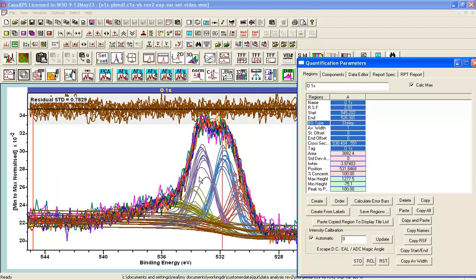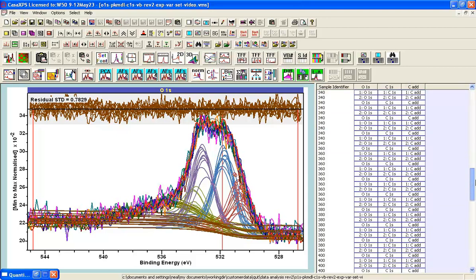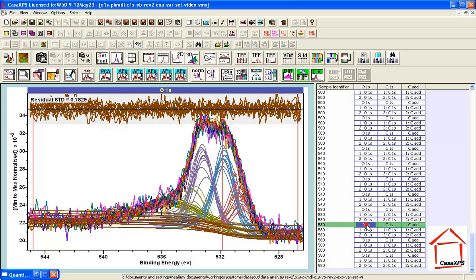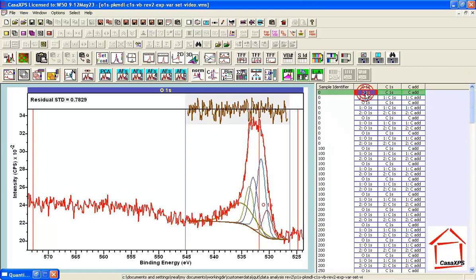While the peaks are relatively stable, this is no guarantee we've found the best four component peaks representing the chemistry expected in this sample when heated. These are just the as-received samples measured multiple times. But looking down the data set — specifically to the very end — the shape of the peak has changed considerably. So despite a consistent peak model for the initial spectra, it doesn't necessarily mean this will be good enough to fit the entire data set.